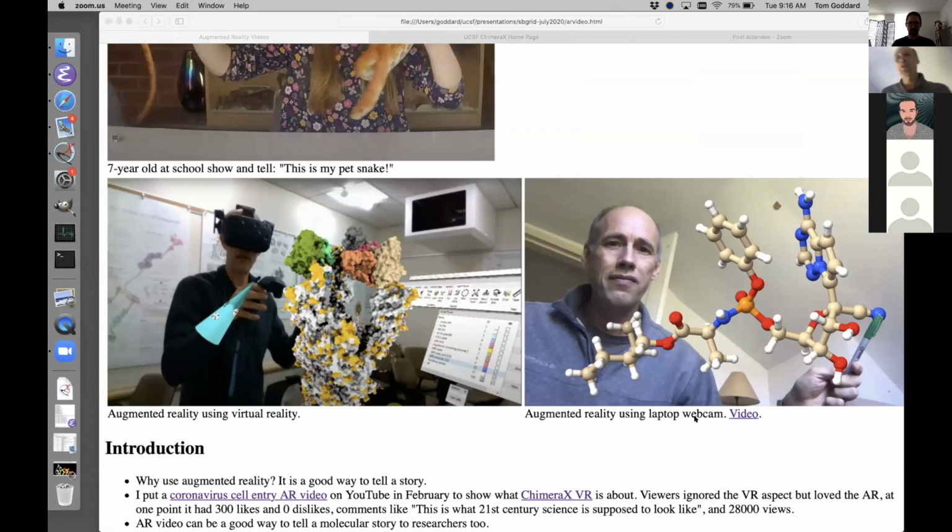You saw that I was wearing a VR headset, okay? And in that headset, I see the molecules and everything in 3D. So it's very easy for me to manipulate them. And I can do whatever you could normally do in ChimeraX with those molecules. I just switched through and showed you some different kinds of data, just hiding and showing the models. I was doing that in a tricky way with a button on the VR hand controller.